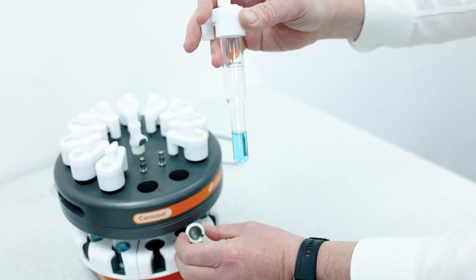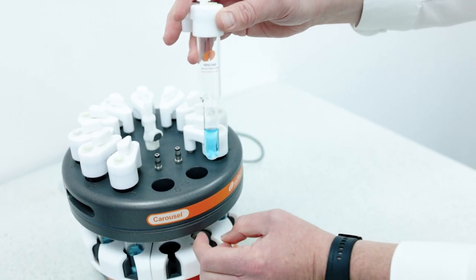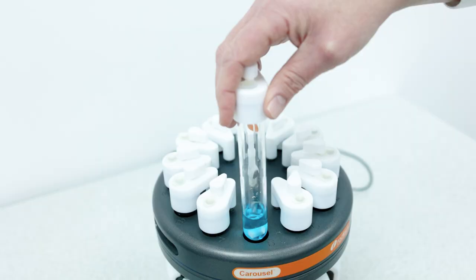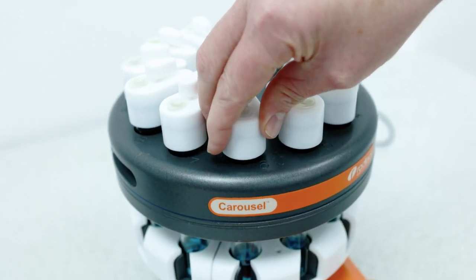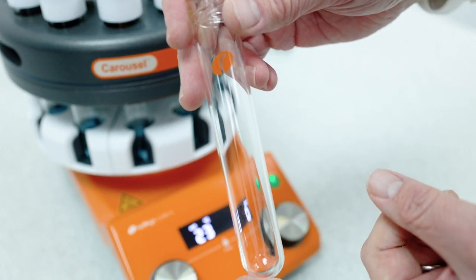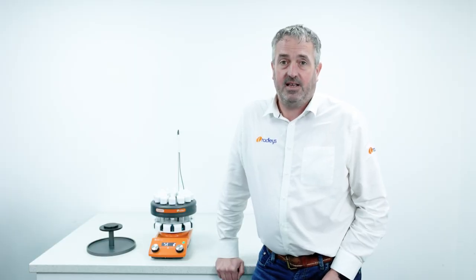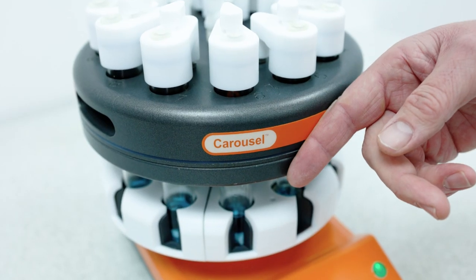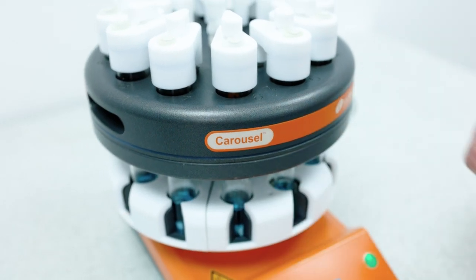It's just a case of selecting the right glassware for your reaction. You can use the reduced volume tube with insert for volumes down to 1ml, and the standard tubes for volumes up to 20ml. All our glassware is made in-house by a team of expert glassblowers, manufactured to high precision to ensure excellent heat transfer in the base plate and efficient condensing in the reflux head.